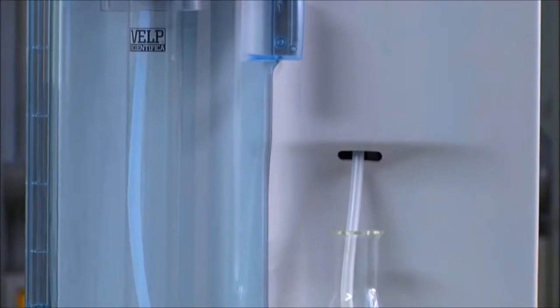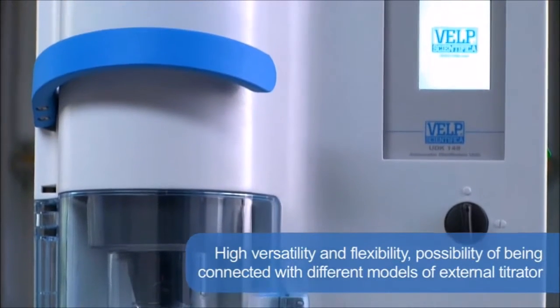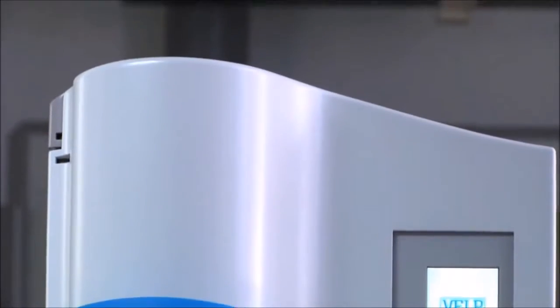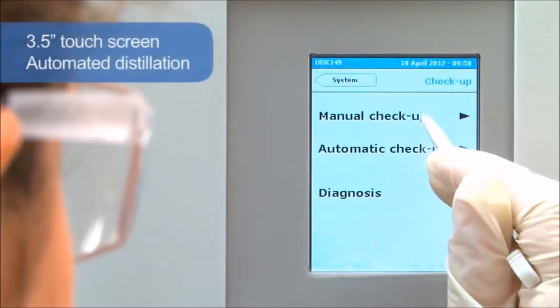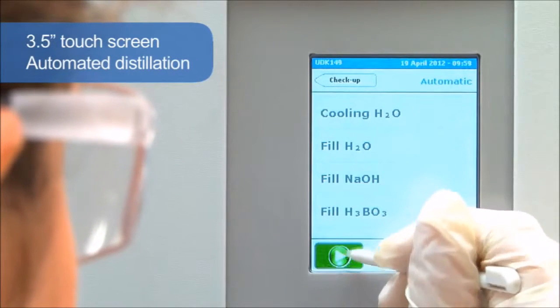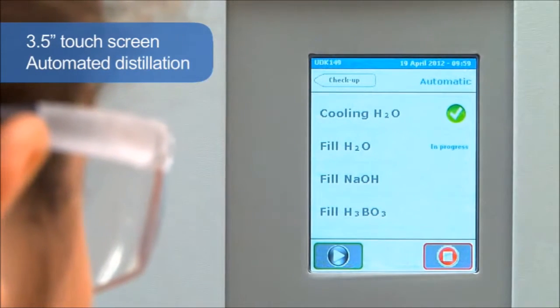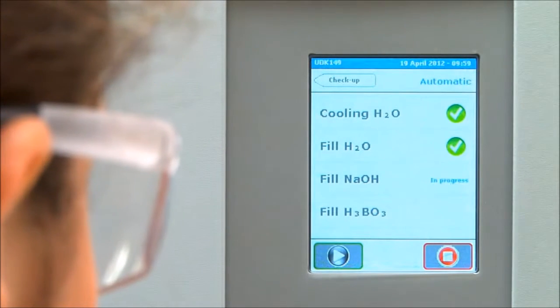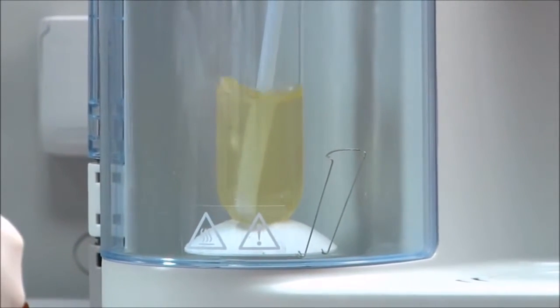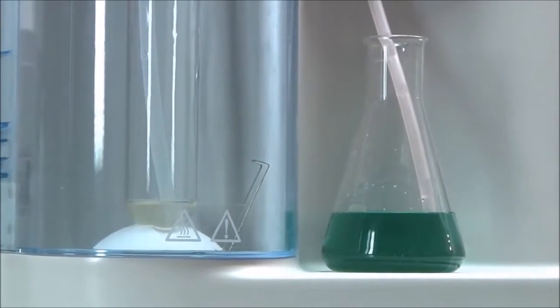The VELP UDK 149 offers the highest versatility and flexibility, thanks also to the possibility of being connected with different models of external titrator. With a 3.5-inch touchscreen color display, the UDK 149 achieves automatic distillation through alkali, dilution water and receiver solution addition with pre-programmed distillation protocols and reaction times. It provides regulated steam output and conveniently automatic draining of sample residues.